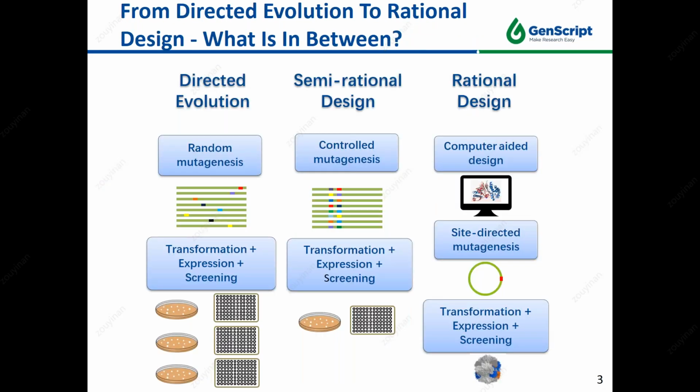In directed evolution, sequence diversification and screening are often repeated multiple times to retrieve the candidate with the best performance. Each round or cycle introduces additional amino acid substitutions and provides a protein sequence closer to that of the protein engineering target.